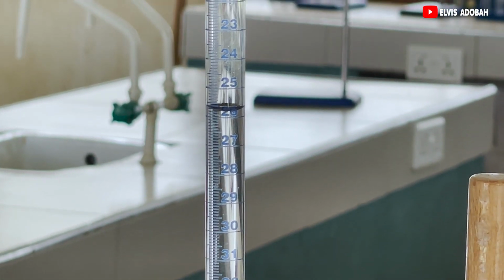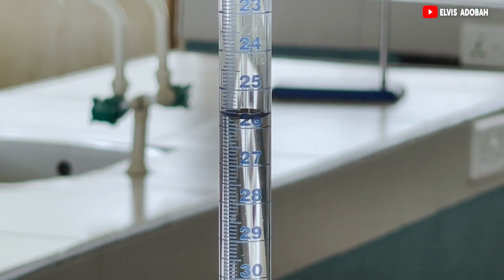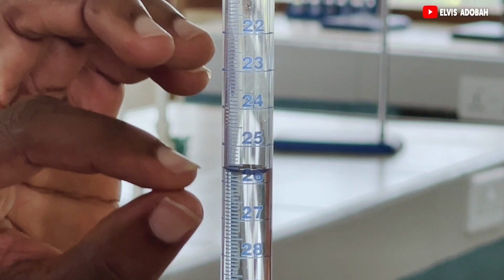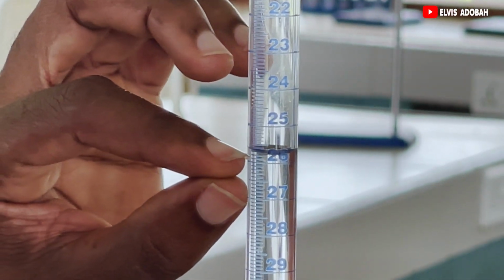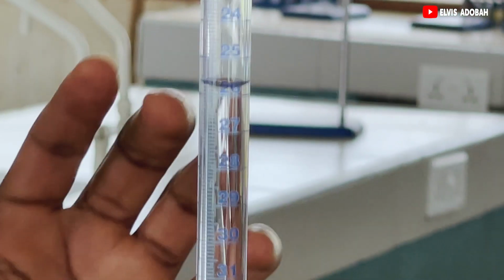25.7. Please zoom in for me. 25.80. Good. The top of the meniscus is on the 25.70 mark, and the bottom of the meniscus is on the 25.80 mark. So don't let us confuse ourselves.